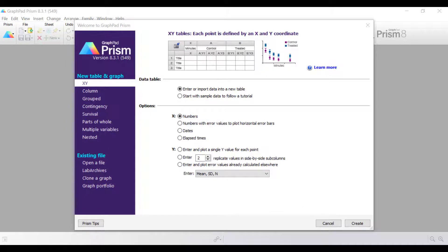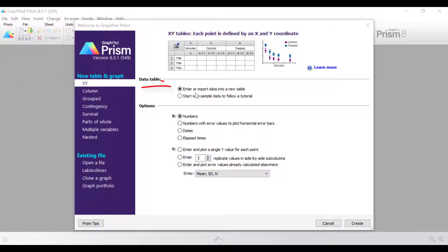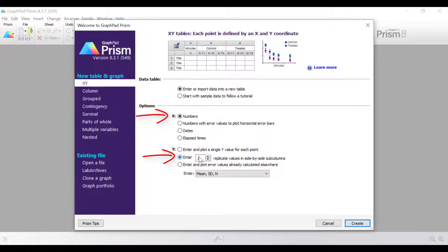So let's go into Prism and begin creating the first spaghetti plot variation. I'm going to start creating a new X, Y table and graph. I'm going to enter and import data into a new table. My X values are going to be numbers. My Y values I'm going to enter four replicate values in side-by-side subcolumns, and then I'll click the create button.